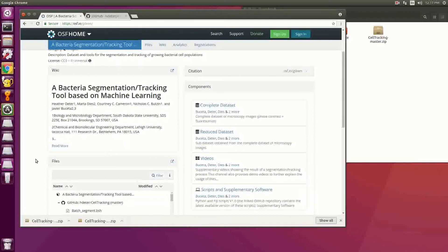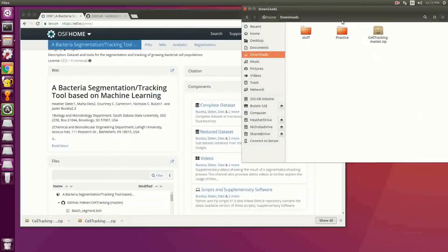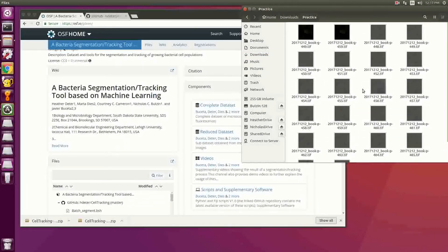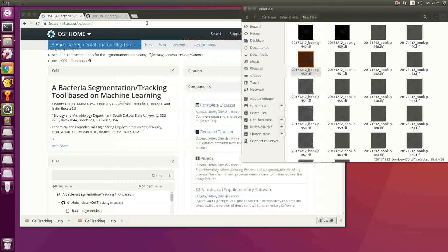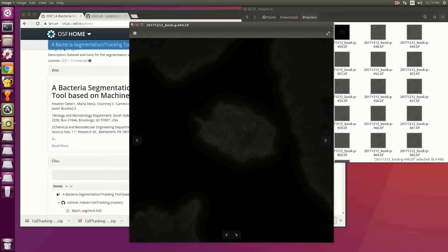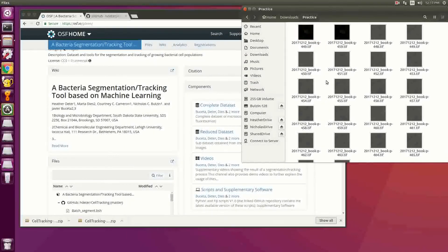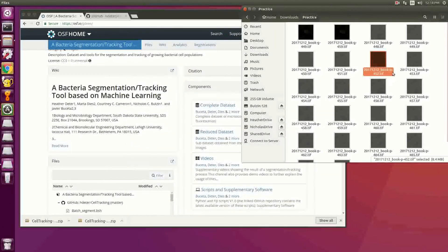If you're going to follow along with this tutorial, I'll be using the reduced dataset right here, which I downloaded and put in a folder called 'practice'. All the images used for these tools need to be 16-bit black and white images. If you're using fluorescence like we are, they need to be two separate images — don't have the images stacked, it's not going to work. They all need to have a dash, p, dash, three digits, then .tif. That's so the scripts can loop through all the files. If you don't have that filename format, it's not going to work. All phase images should be labeled 'p', and all fluorescence images need to be labeled 'g', regardless of the channel.